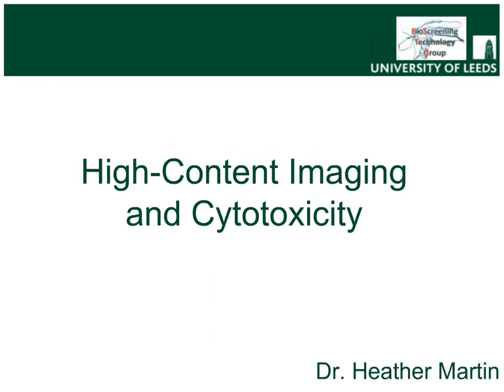Hello. My name is Dr. Heather Martin from the Bioscreening Technology Group at the University of Leeds, and I'm going to talk today about the role high-content imaging can play in the detection of cytotoxicity.